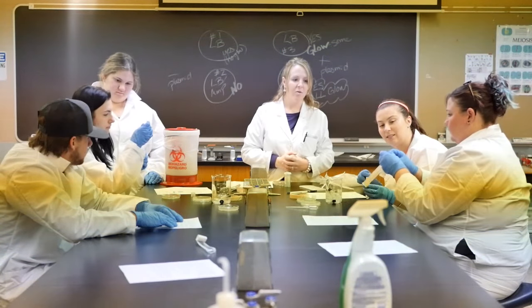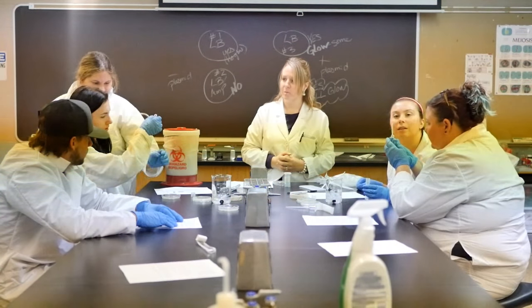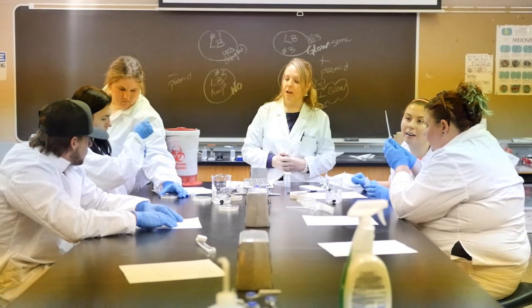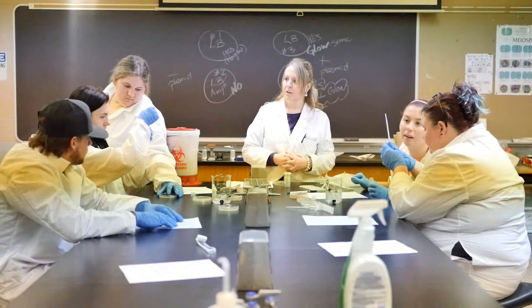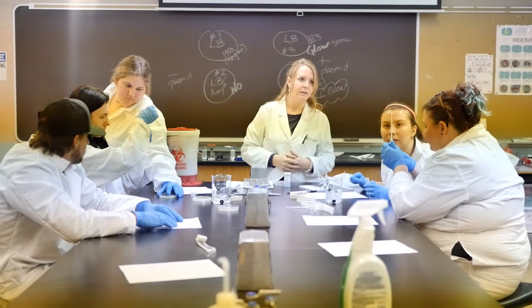As soon as you've got your broth onto your plate, get some beads on there and mix it around. The broth will end up absorbing into the agar, so you don't want all of your cells to be in one spot. You want to get it mixed around as soon as possible.